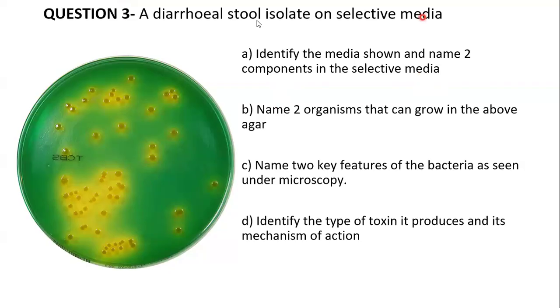What is seen in thiosulfate, citrate, bile salts, sucrose, agar? Sodium thiosulfate, citrate, yes, all those. Sucrose, bile salts, okay? Two organisms, this is very, very specific.